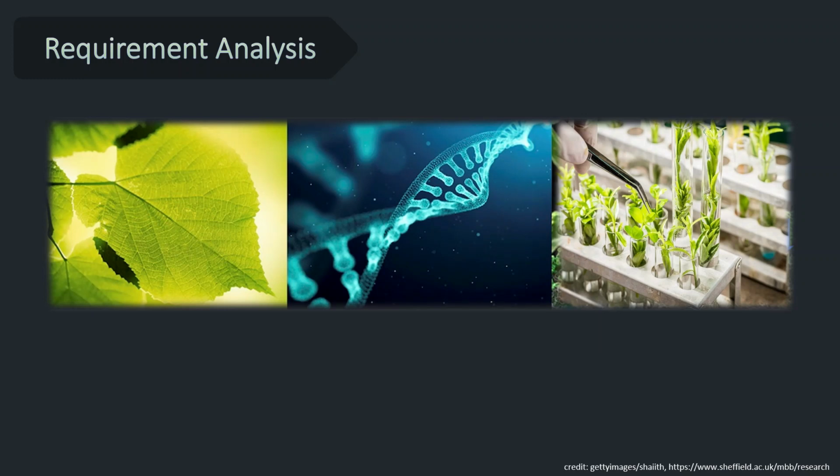And so we set out to build an interactive visualization tool that addresses these limitations and can be used in a wide variety of scenarios. And to do this, we gathered our requirements by working closely with 3 teams of genomic researchers, working in different areas of biology, plant science, and crop breeding. We met with these teams numerous times over the last 2 years to understand the various genomic tasks they perform and distill them into 6 major visual and interaction-based requirements.